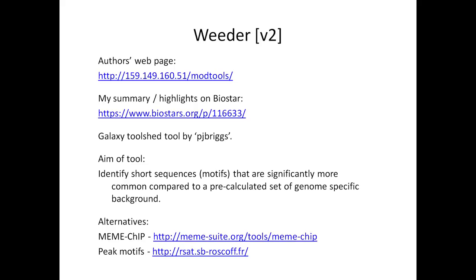It was initially used to identify common motifs in defined promoter regions, but has evolved to consider much larger numbers of input sequences, as seen with ChIP-seq data.